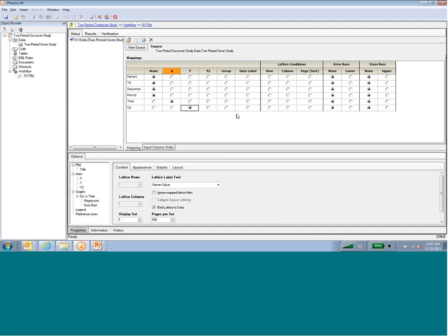You can also use other information, such as the patient and treatment group, to sort or separate out different plots. When one uses a group variable, that will take all of the levels within the column and make a figure legend with different colored lines. For example, if we map patient as the group variable, you will get a legend identifying the patient number.